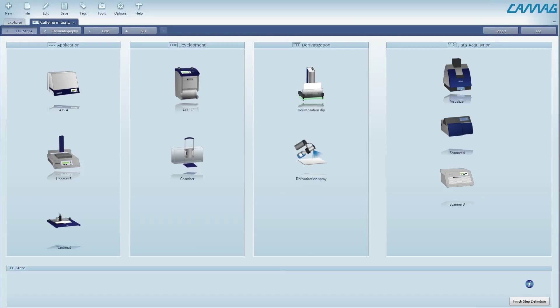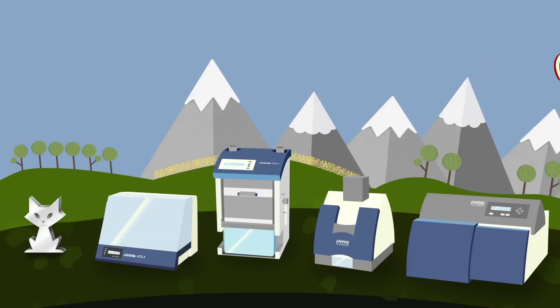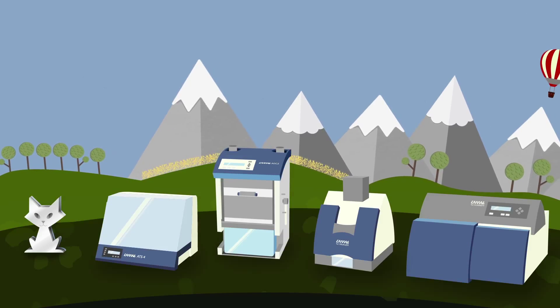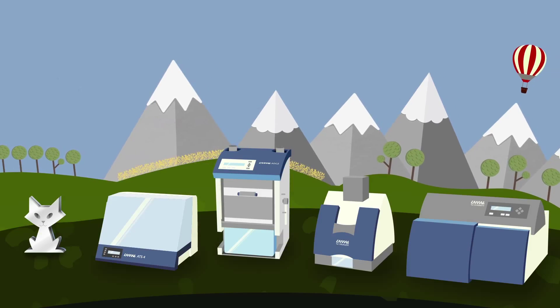Creating your own method has never been easier. Simply define the desired analytical steps or select one of the default methods and start working.